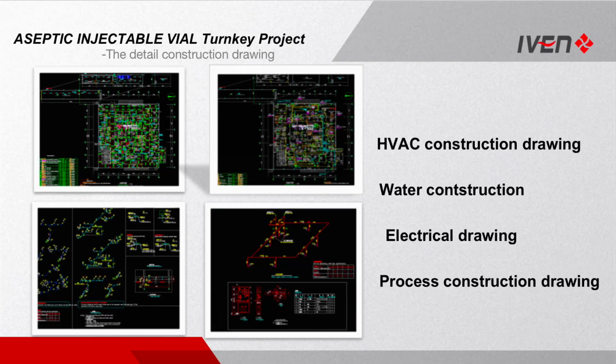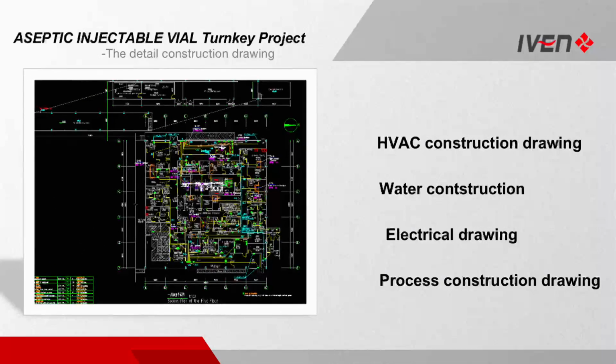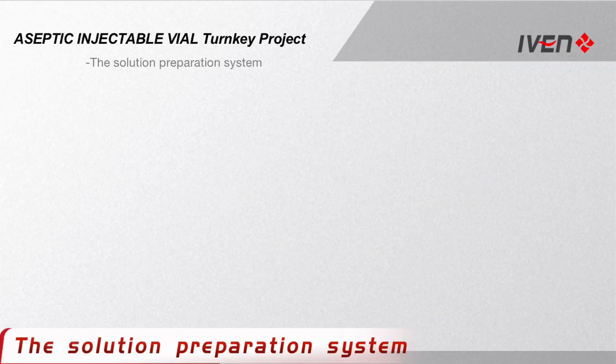After that, we will give you a detailed drawing, which includes the HVAC construction drawing, the water construction drawing, the electrical construction drawing, and also the process construction drawing. Then we will go to the solution preparation system.